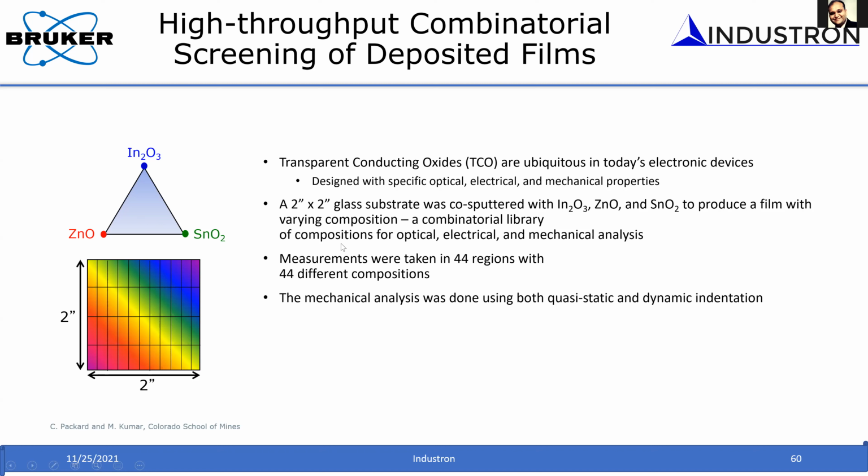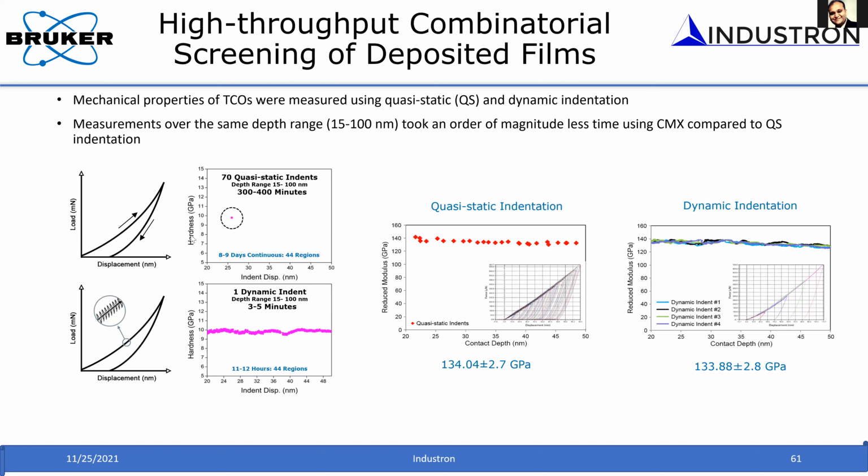Okay, and then you can get this load displacement curve. We can get this hardness and modulus. These points that you see are a measure of modulus for each load displacement curve. Okay, and this is what I mentioned. You can see in the inset, you have multiple load displacement curves superimposed onto each other, and from each curve, you independently measure the stiffness, and from that you measure the modulus and then hardness. Okay, so you can see the modulus and hardness plot here.